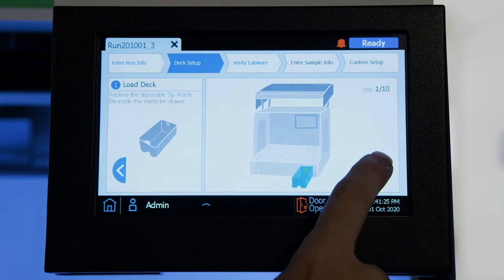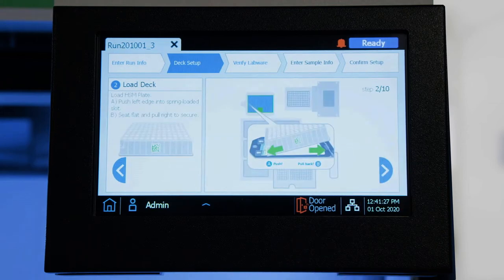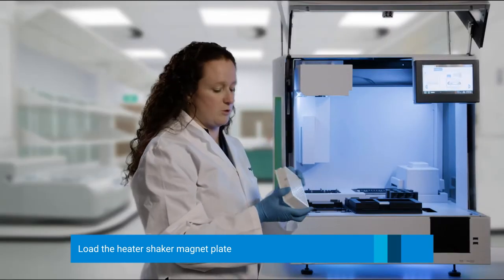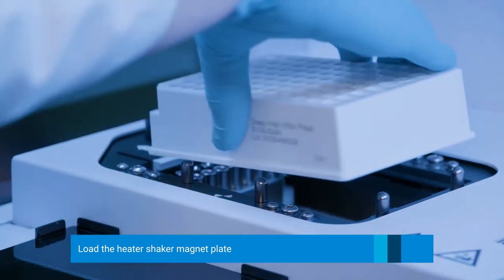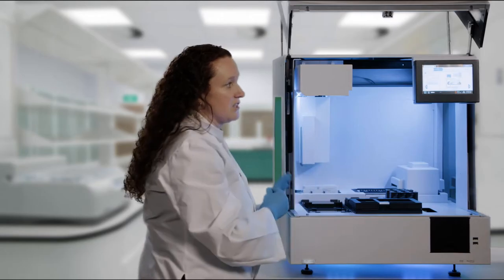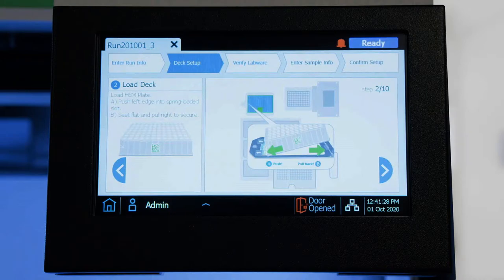We'll click Next, and now we are going to load the heater shaker magnet plate. This is also found in the consumables box. It is located in the back left corner. You are going to want to push it to the left and insert it just as the diagram shows on the touch screen.